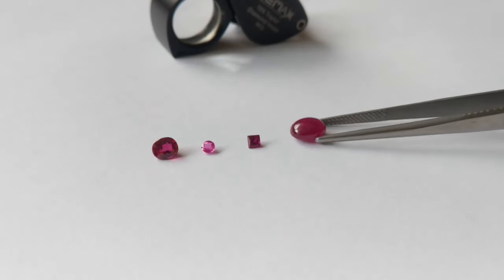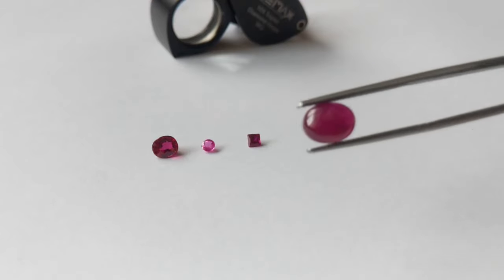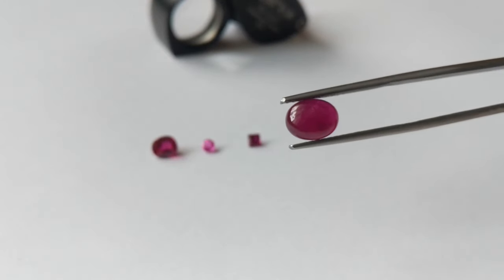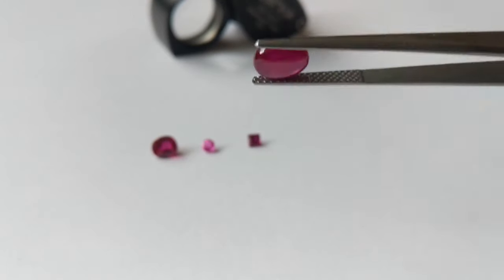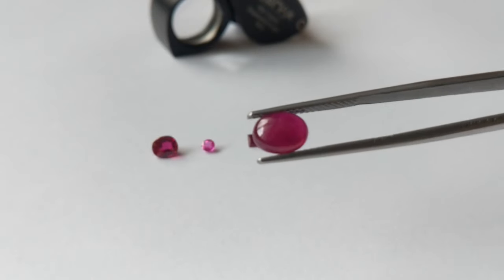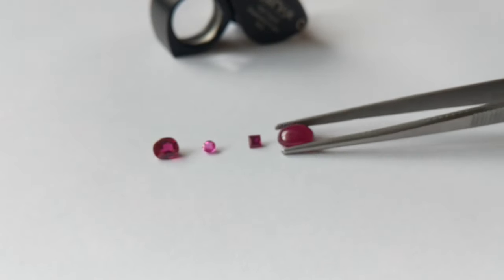So first let's look at this first one right here. So this one is a cabochon, not so clean ruby. So do you think it's synthetic or real?